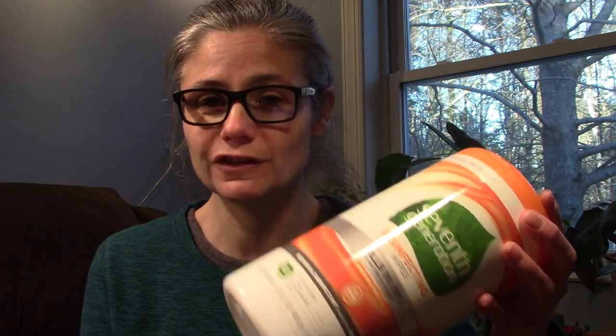About a week later, making sure that everyone in my family flushes with the lid down, then I'll clean the walls again using the 7th generation disinfecting wipes. Then I'll instruct everyone in my family to flush with the toilet lid up for about a week. Swab those walls again and compare the bacterial growth between flushing with the toilet lid down and flushing with the toilet lid up. This one ought to be interesting. Let's see which is better for your bathroom, flushing with the lid up or flushing with the lid down.